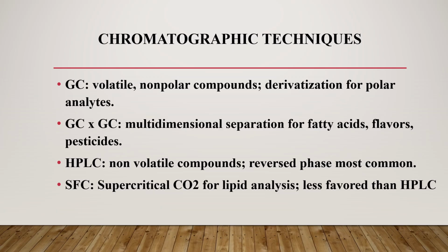HPLC is the most widely used technique for non-volatile compounds. Reverse phase HPLC is especially versatile. Supercritical fluid chromatography, or SFC, uses CO2 under high pressure to extract lipids efficiently, though it is less commonly used due to operational challenges.